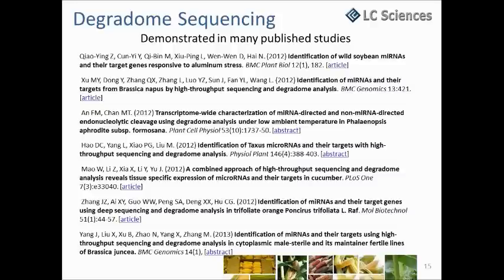We can go further. So for bioinformatics, we know there are a few tools to do the prediction. And we need to keep in mind that the prediction normally still requires experimental confirmation, and also we know there are many false positives and false negatives. And even if we change to a different database, like the messenger RNA database, or we use a different microRNA database, we may get a different result from the prediction. And also a different protocol or different program will give a different prediction. So one thing I remember is that if you use different prediction methods, normally they share only 40% of the same prediction, and the other 60% will give different results.